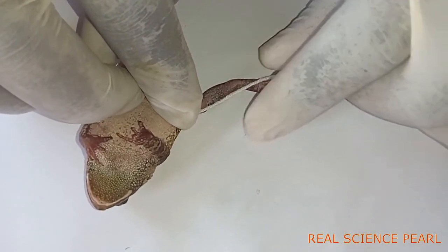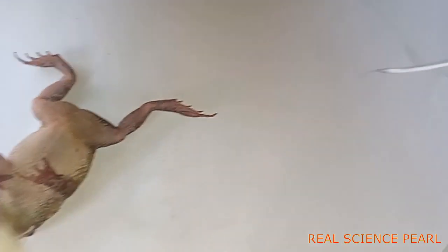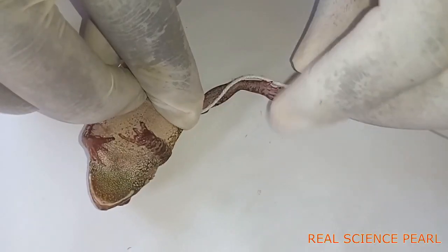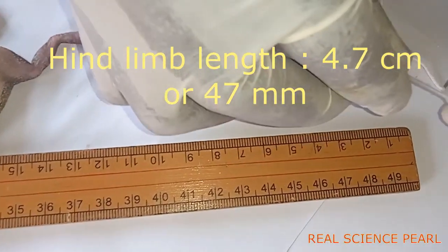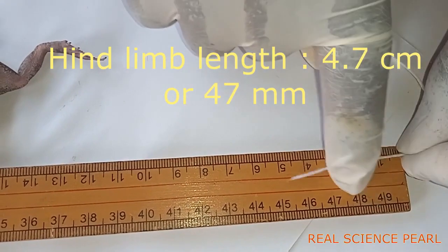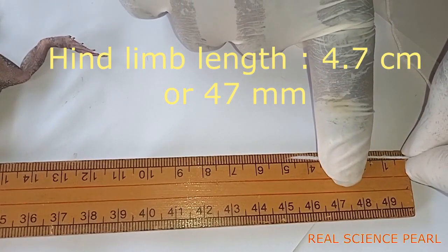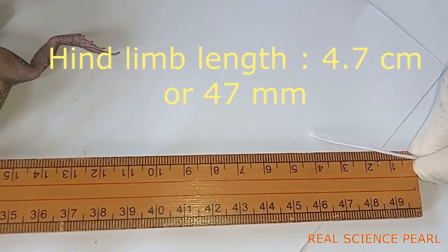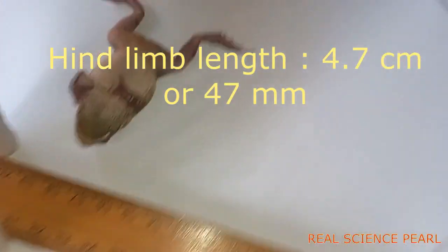You may be required to measure the length of the fore limb and the hind limb and record the results, to state the significance of the ratio. You should use a thread to measure the hind limb because it is folded. Mine is 4.7 centimeters — remember you can be required to record in millimeters, so multiply by 10 to get the value in millimeters, which would be 47 millimeters.